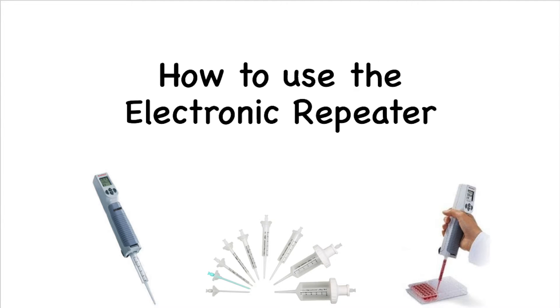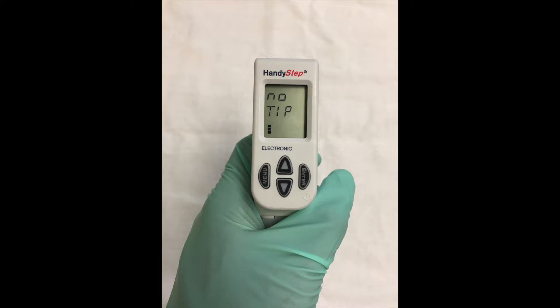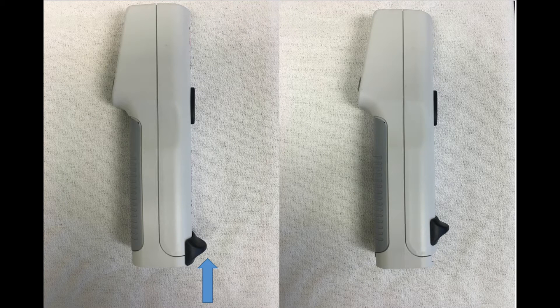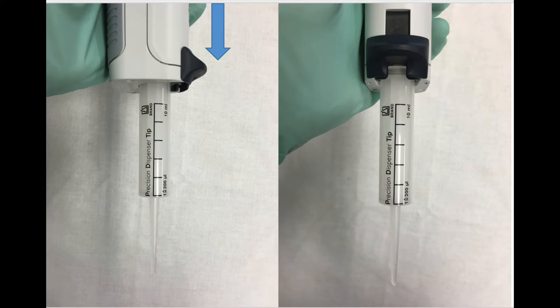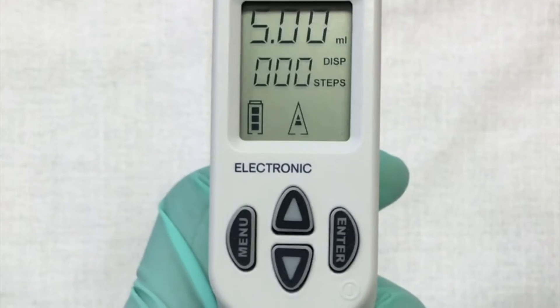Now let's look into how to use the electronic repeater. To begin the process of dispensing with the electronic repeater, first look at the screen. It should read NO TIP. To insert the tip, push up on the recognition mechanism, then slide the tip inside the device, and then push down on the mechanism.